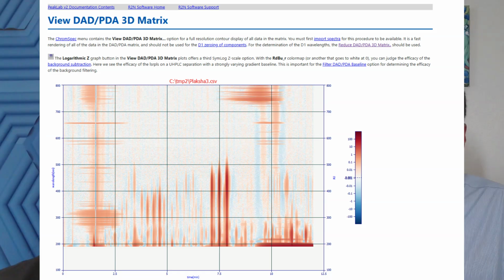So we're going out there and picking two different wavelengths. You can often get that separation of two co-eluting peaks very simply. And this is widely used, and the very competent, intelligent people out there that really want to use the 3D data for all it's worth will be doing this kind of thing right now. And it helps to be able to have a full picture, like you see here in this one, because it can make a difference. Now, there are other places where you don't have that option.